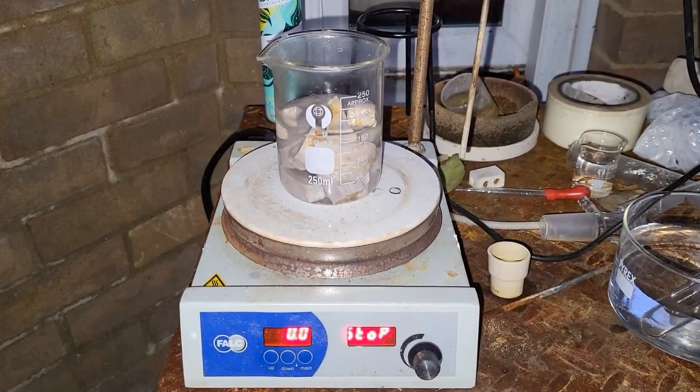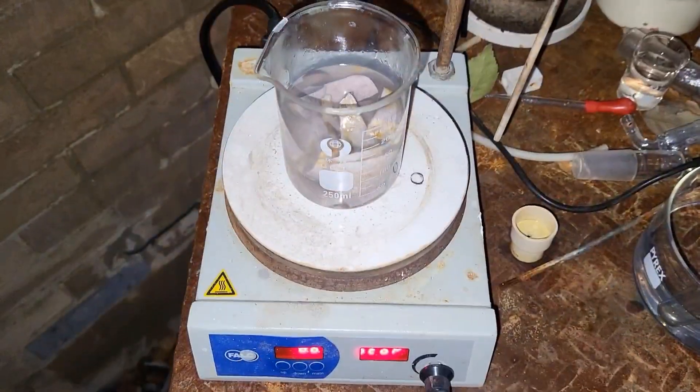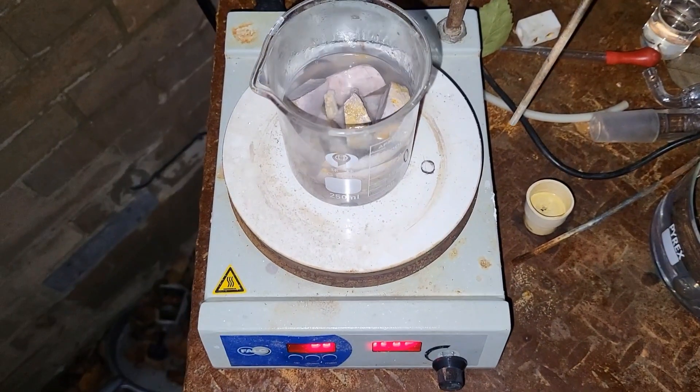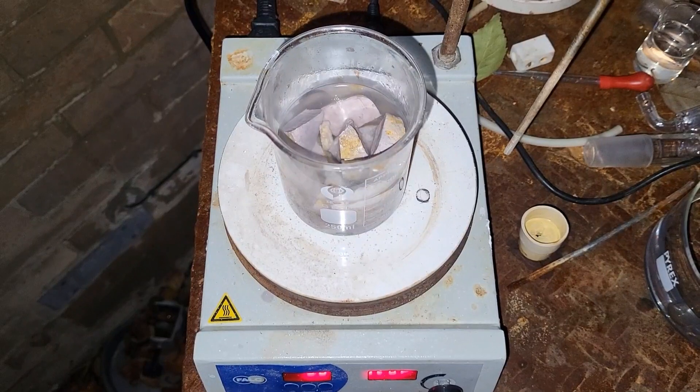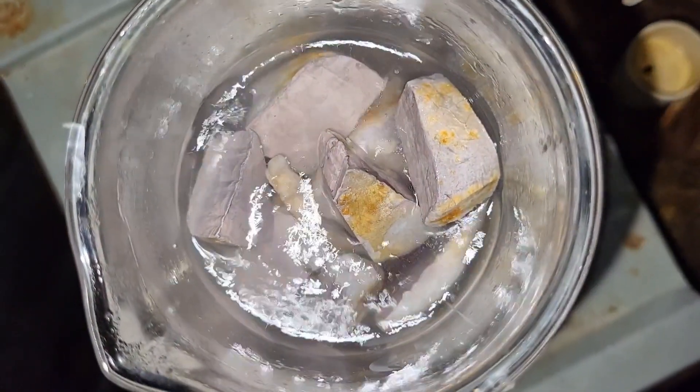I'm going to warm this sodium up. This is not ideal for melting the sodium because hexane boils at 68 degrees and sodium melts at 97 degrees, so this is not going to melt.